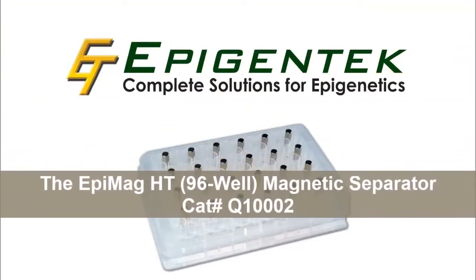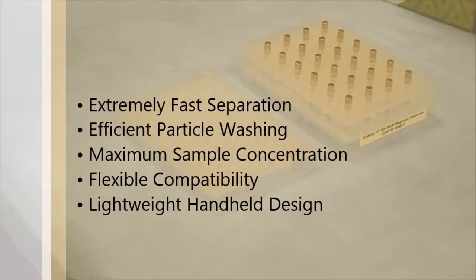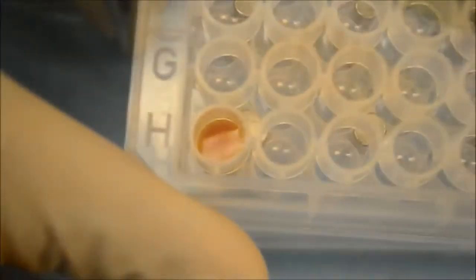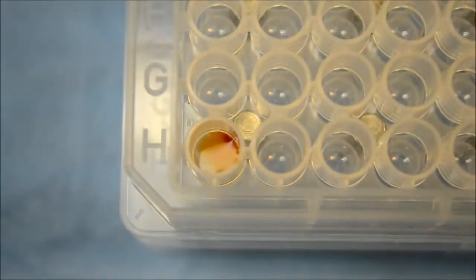The EpiMag magnetic separator is a powerful magnetic stand for paramagnetic bead precipitation of liquid samples from various 96-well microplates. Fast and efficient, this magnetic separation of standard purification beads takes only seconds with the EpiMag, as you can see in this real-time demonstration.